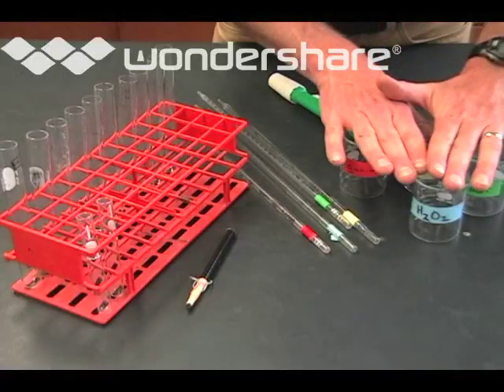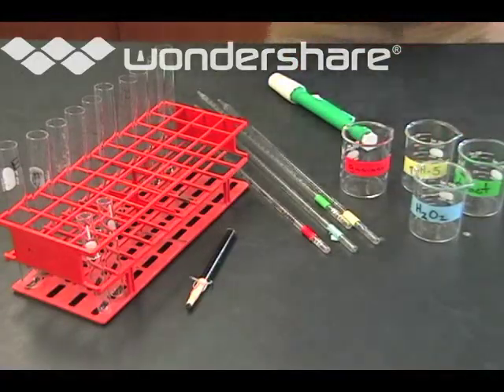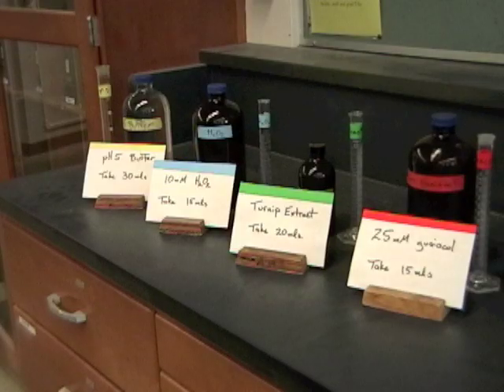Next we have to go and get the reagents that you'll be using for this. So these are all the reagents that you need to do the enzyme lab. There's the guaiacol, the turnip extract that has the enzyme, the hydrogen peroxide, and then a pH 5 buffer.